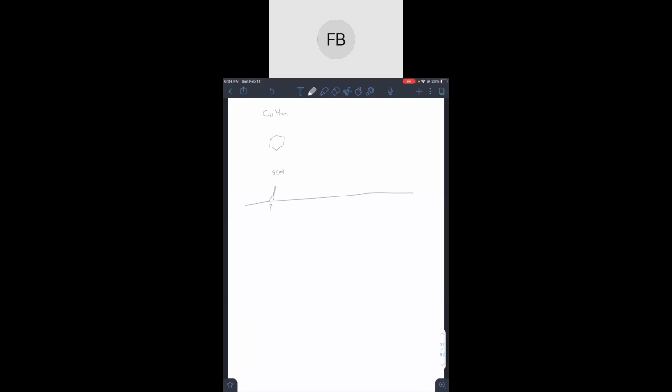So I can go ahead and draw my aromatic ring, and it tells us there's 5 hydrogens coming off of it. So we know that it only has one functional group coming off of the ring. Do you guys see what I'm saying? There's only one thing coming off of the ring, because there's 5 hydrogens. So there's no way that there's like a bromine attached to the bottom, because there's 5 hydrogens. Okay, so next, once we've drawn our basic structure, let's go ahead.